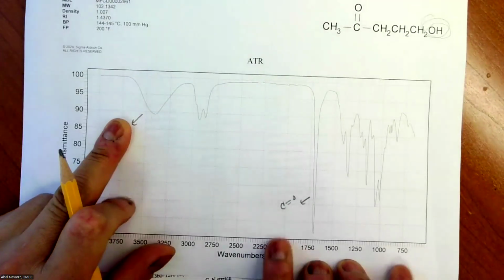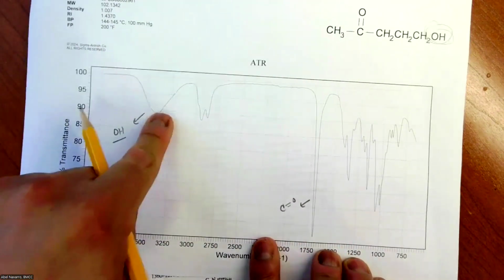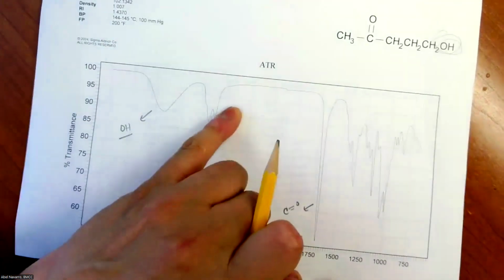But I have an OH. Is this a carboxyl group? No, it's not a carboxyl group. Why? Because to be a carboxyl, this OH should be what? It should be distorted, stretched out. And that's not the case.